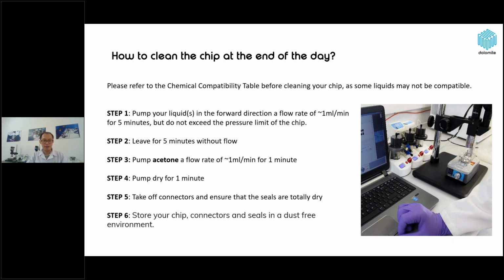And step 5 is to take off the connectors and ensure that the seals are totally dry before storing the chip in step 6. After that, you store the chip, connectors and seals in a dust-free environment, like the sample chip box or a dust-free bag, such as a nylon bag.